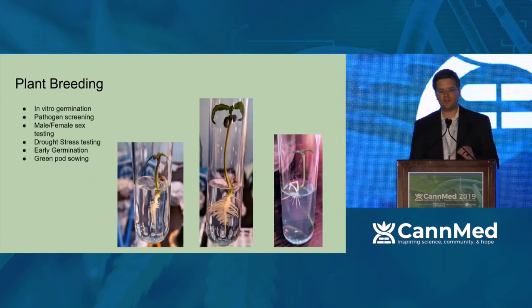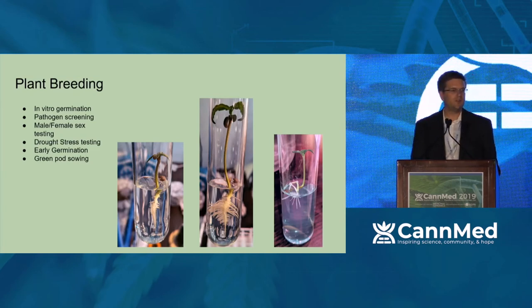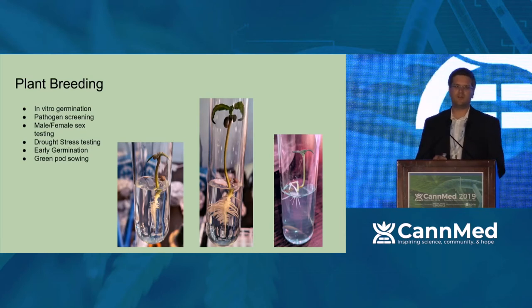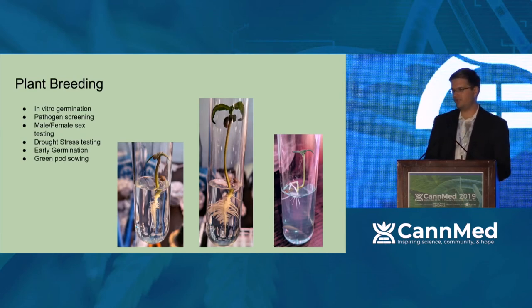Plant breeding was another aspect of cannabis tissue culture that a lot of people have had interest in, so I'll touch briefly on it, and that's you can germinate plants in vitro, so inside the test tube. It takes about 8 days for them to get to about the point of the middle picture, and you can screen them for pathogens. Medicinal Genomics, I know, has a female-male indicator for sex testing, and what I found was if I grew them in a test tube, I could pop open the lid, take a little bit of tissue sample, run it through PCR and extract the DNA, and be able to see, is it male or female, since it does not detect hermaphrodites.